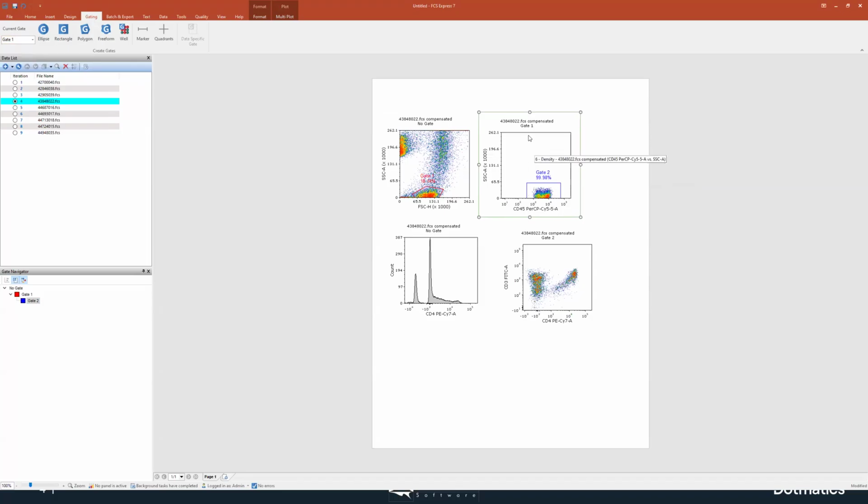But now we've also made it so you can just click on the title and change the gate to whatever you want. And it shows up as a hierarchy and within the context of its hierarchy, so that you can find your gate easier. So this is one of those little things where it will be a little bit faster to change gates, and hopefully over time it will help make some difference.